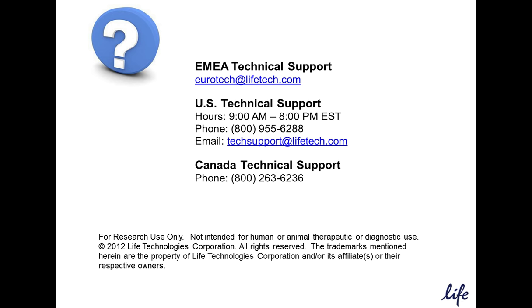There's a question: if the emission filter of a cytometer is changed, do I need to change the controls again? Yes, that is a good idea, because the compensation will depend on a number of factors, including the emission filter and the amount of dye that is collected into a particular detection channel.